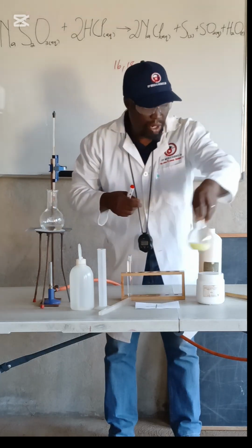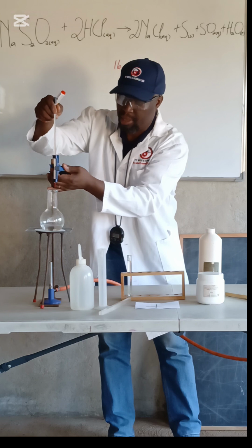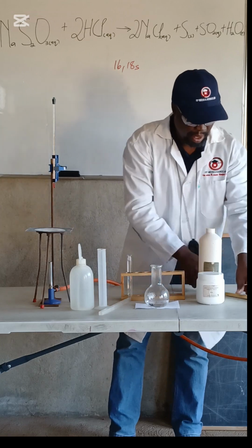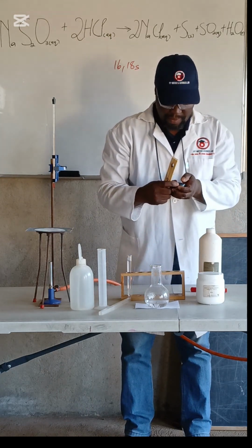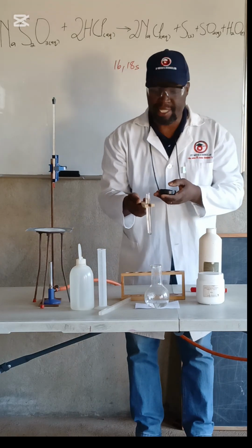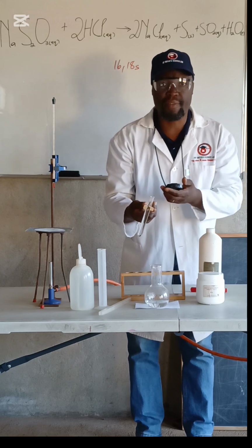Okay, let me remove this one. Place it over there. And let me reset this. Okay, I'm quickly going to pour the solution of hydrochloric acid into the second flask, and let's observe and see what happens.